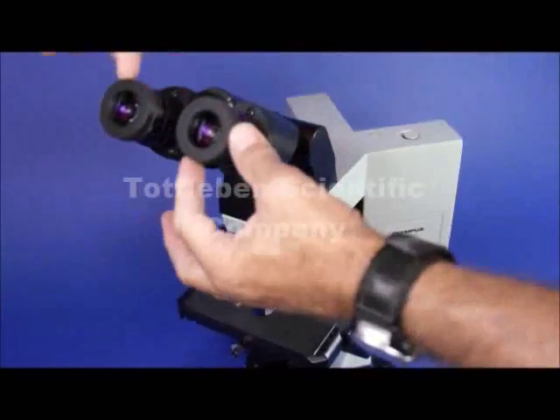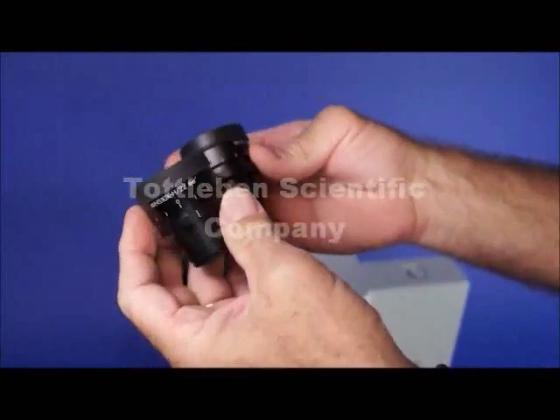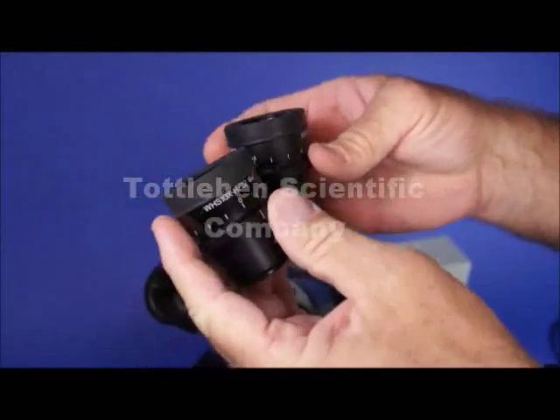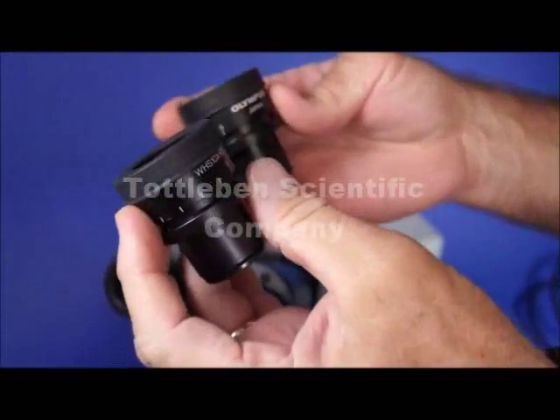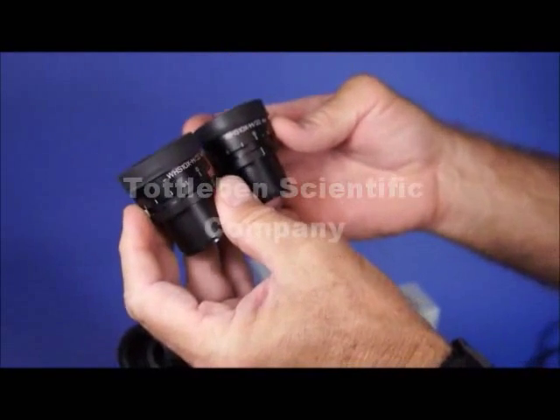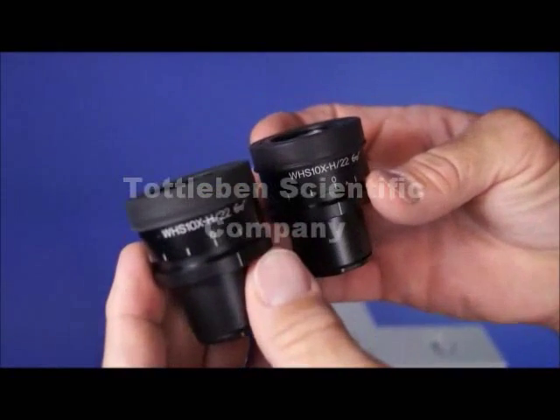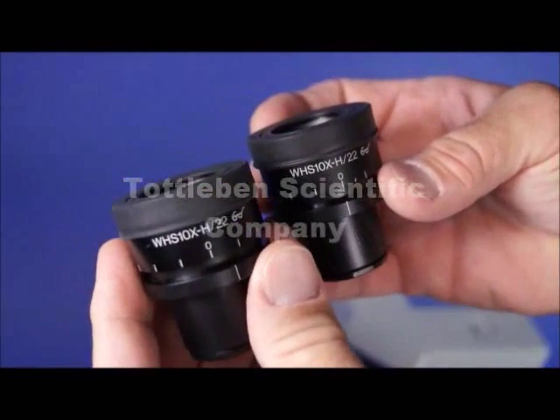Starting at the top and working our way down, I'll show you the eyepieces first. It's got some very nice Olympus helical eyepieces. Helical just means that it's focusable. They're WHS10X-H, which stands for helical, slash 22, which is the field number — a nice wide field.